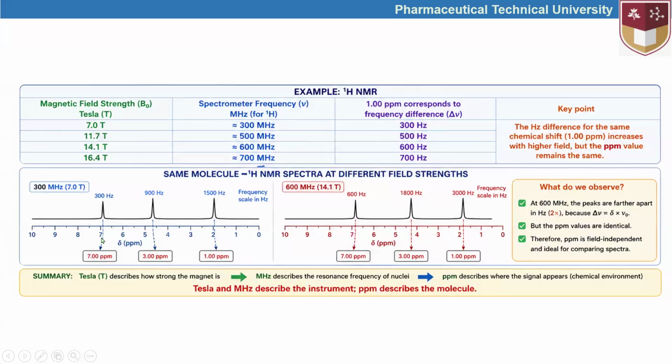If we use 300 and the signal is lower than 7, it has to be lower than 7. Or if we use 1500, around 2, slightly smaller than 2, and slightly smaller than 2 if we use 3000 hertz as well. I developed this figure by using ChatGPT. I didn't notice this discrepancy between 4.5 and 5, and here between 4 and 4.5. Okay, consider this is the error that does not stand for the right point.